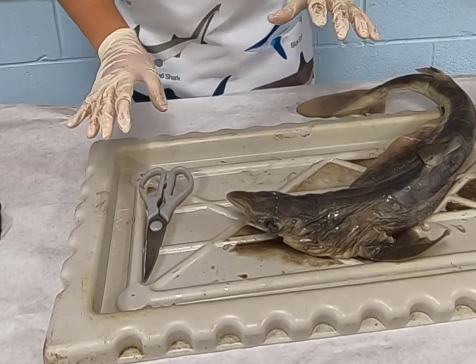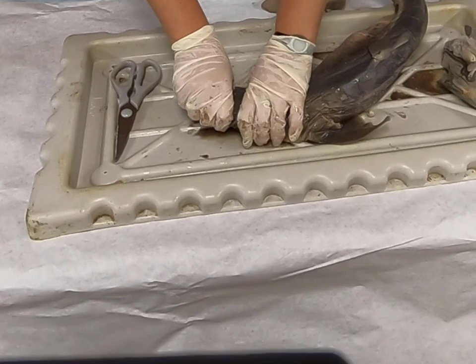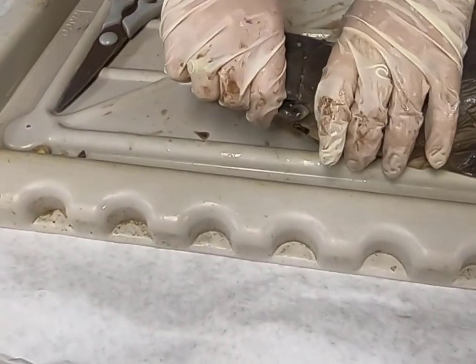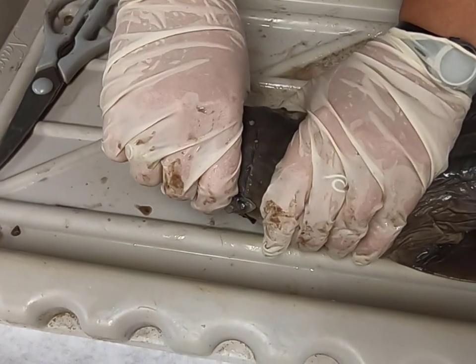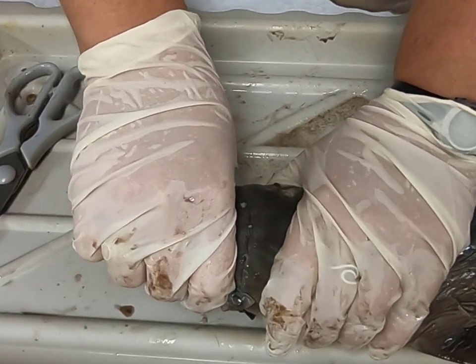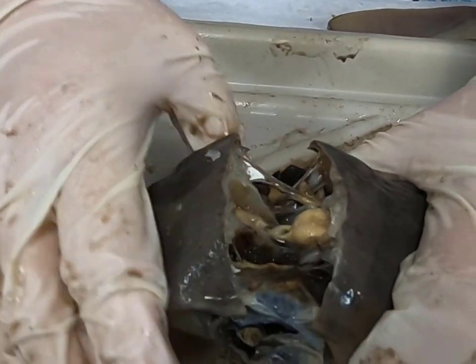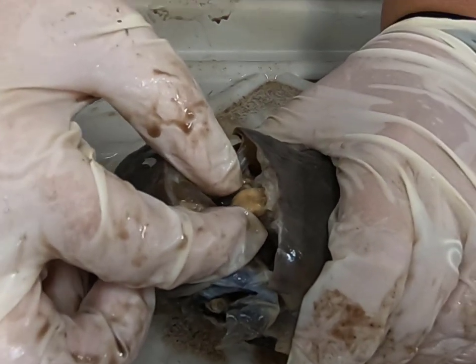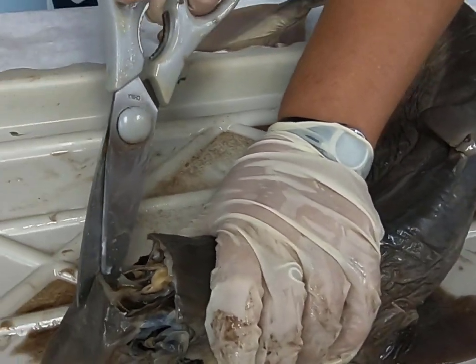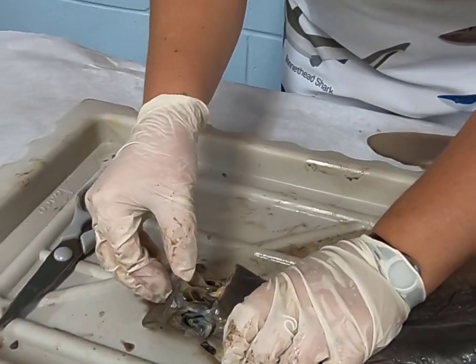But to get through to the brain, we have to become ninjas. So on the count of three, we're all gonna say hi-ya together, and then we will break open the shark's skull, all right? Hi-ya on the count of three. One, two, three, hi-ya! And there's the brain. So we have these two bulbs right here, which are actually for a sense of smell. And let me go a little bit farther into this cavity right here, and we can see the rest of it.